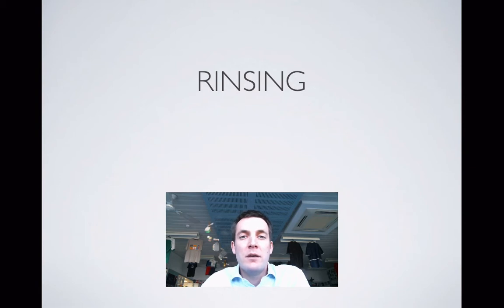Without further ado, let's have a look at some of the things that we might do when we're filling a burette.